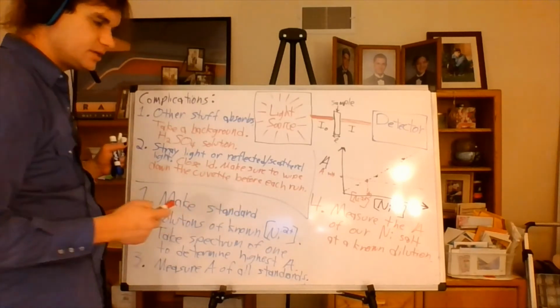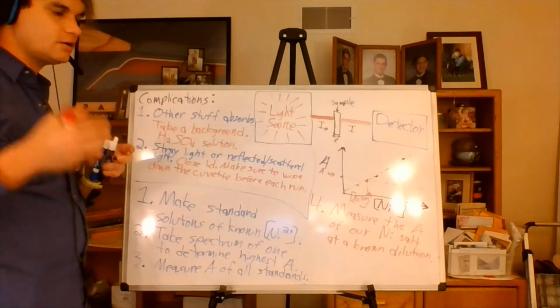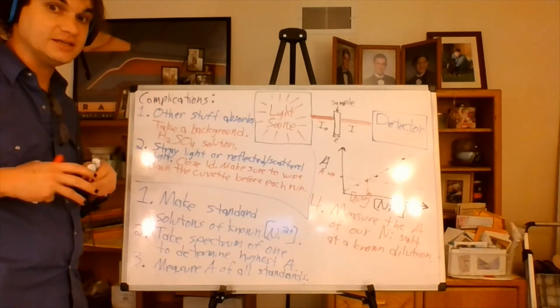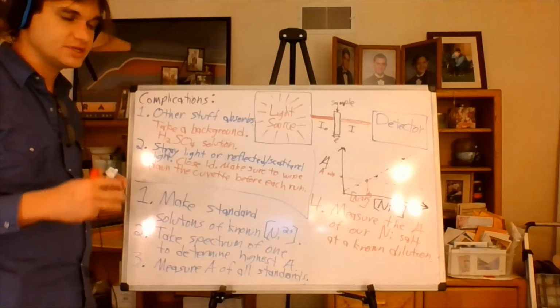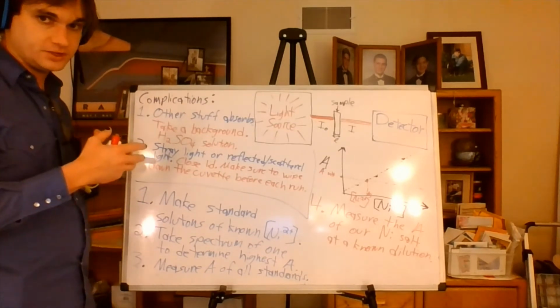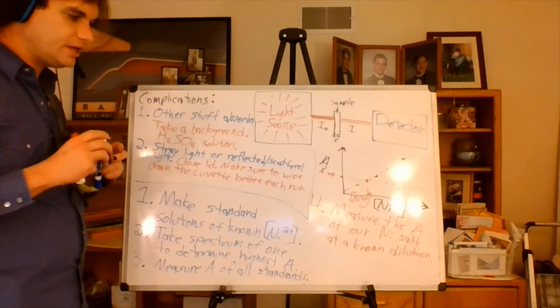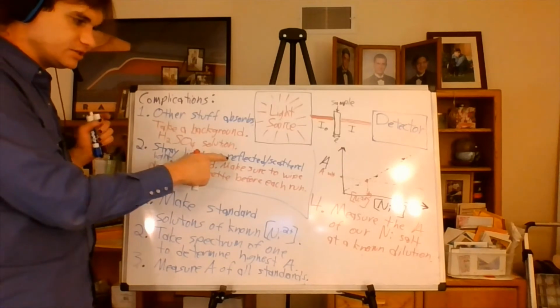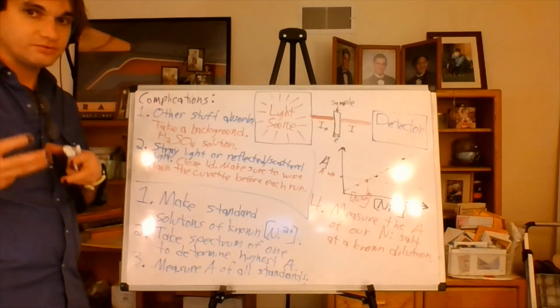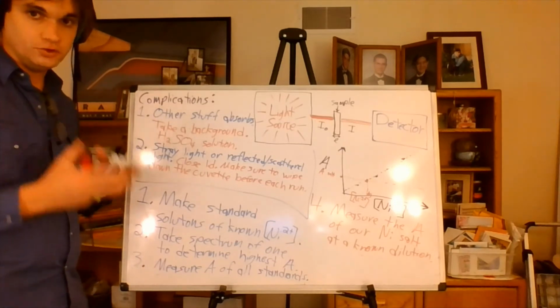What this does is because everything on the inside of the cuvette is the same between the background and the test solutions, except for the nickel concentration, the only differences between the background reflectance and scattering and the test reflectance and scattering is something that could be on the outside of the cuvette.